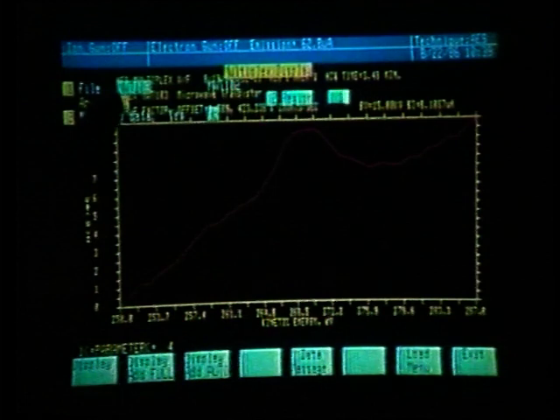Let's now look at region number 2, typing in a 2 and enter. And let's display add automatically using the soft keys at the bottom of the screen. Soft key number 1 would display only region number 2, erasing the carbon region which we presently have displayed.